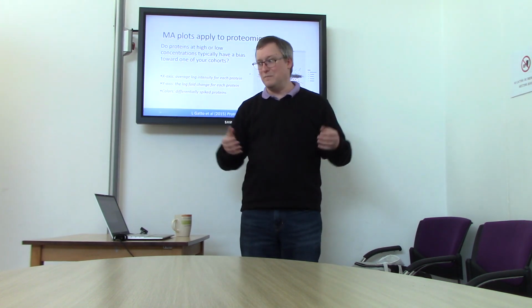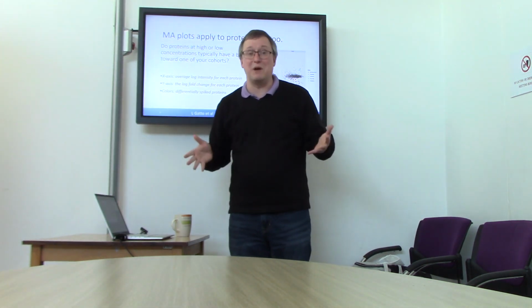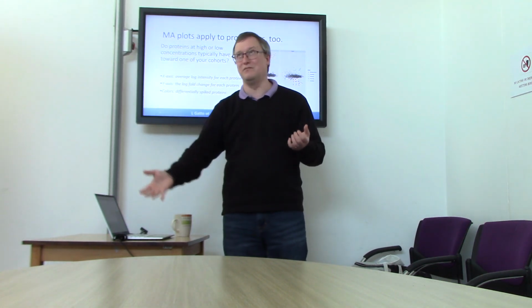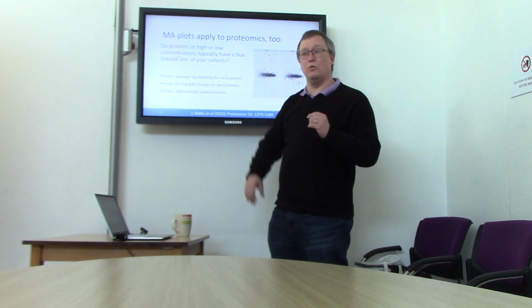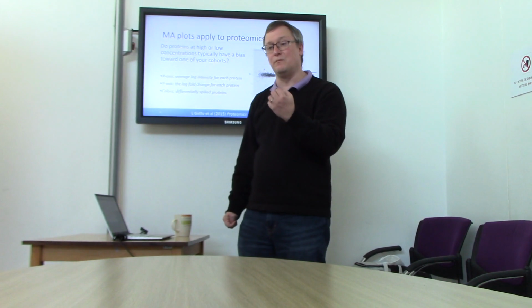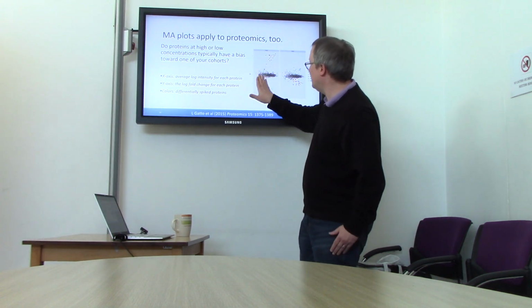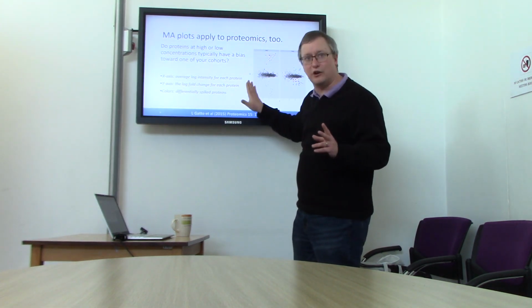And if you don't really have a background of unmoving stuff that you're looking for differences among, that can really mess you up. So you have to be cautious of cohort designs where one cohort is characteristically different in almost everything from a control. It could be that one of your cohorts simply had a whole lot more robust intensities than the other. And if you have a protein at very low abundance, which is to say at the left of the plot, you might find that you have a skew pushing up where the proteins are seemingly more abundant in the cases than they are in the controls.